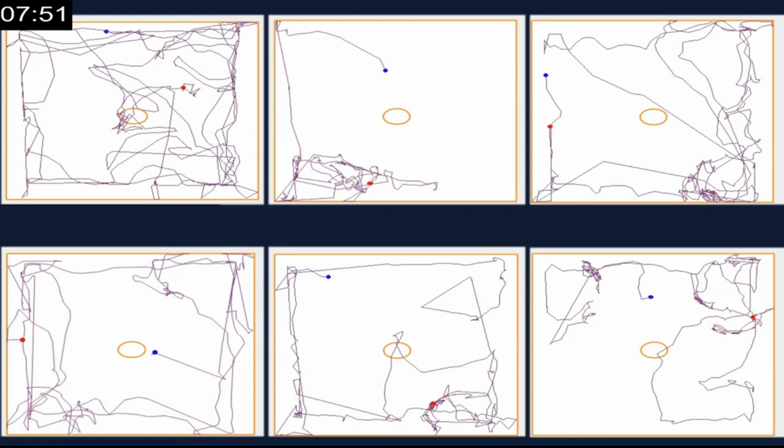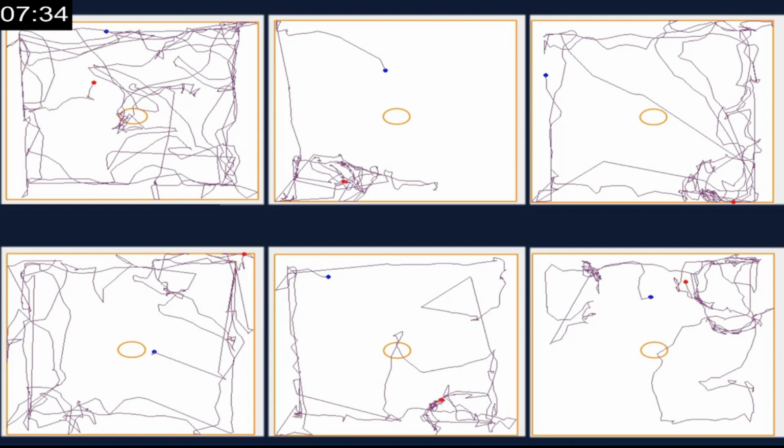Before you start the experiment, animals should be acclimatized in this box for 5 days, for 10 minutes each time, and this experiment is generally performed for 10 minutes. After completion, animals should be provided food, because before that you have to keep the animal fasting for 24 hours, especially when you use rats. In case of mice it should be 6 to 12 hours.